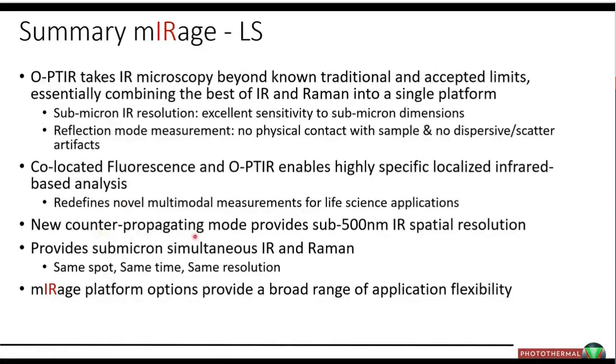The new counterpropagating mode takes us from sub-micron now to sub-500 nanometers. And maybe my favorite still is, of course, the IR and Raman, same spot, same time, same resolution. And with that, I'm going to hand over to Andy.